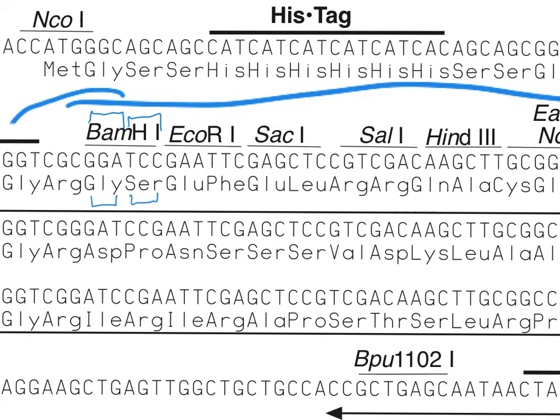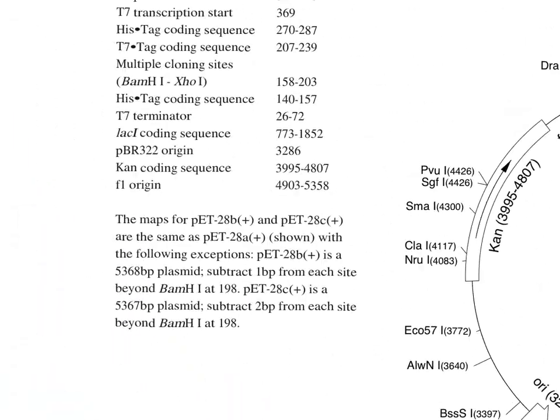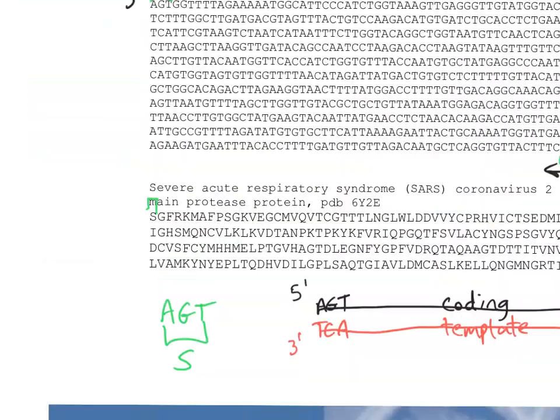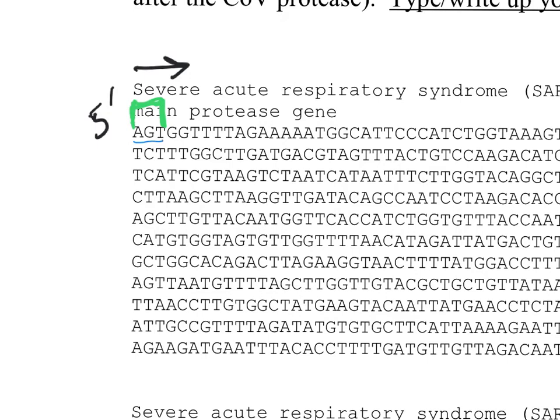So if you were to code anything in BamH1 and that was your restriction site, you would just start right after this, the same way, by the way, with EcoR1. You would just start going back to here now, the sequence right here would start in, and it would be in frame.